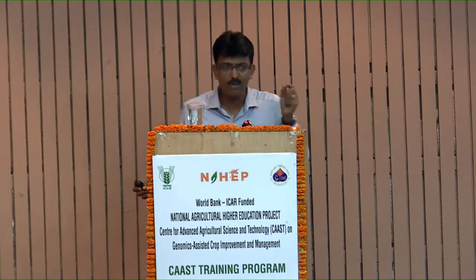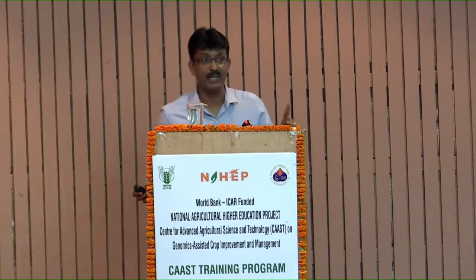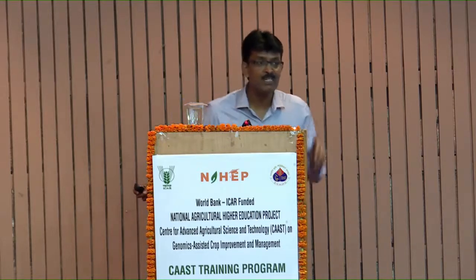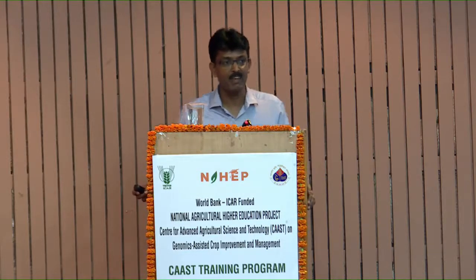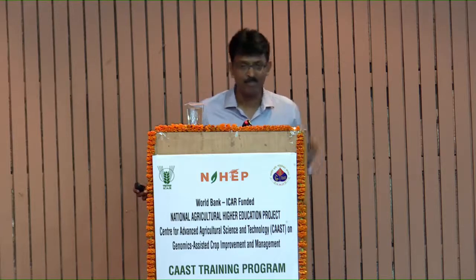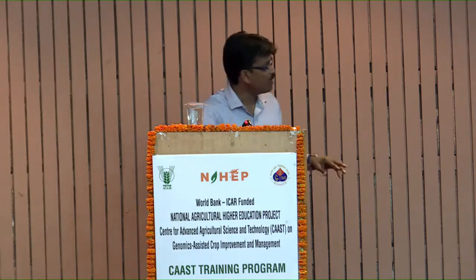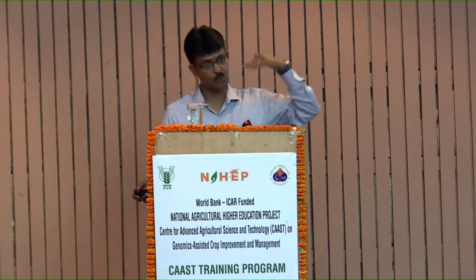There may be some little ground fluorescence because remember, you are adding 15 nanogram of double-stranded DNA where theoretically the dyes can bind, especially in the case of SYBR Green method. But remember, that binding will not give any tangible fluorescence to the machine. So there will not be any graph at all. It will be the lag phase. The second one is the early exponential phase, then the linear exponential phase, and the plateau.